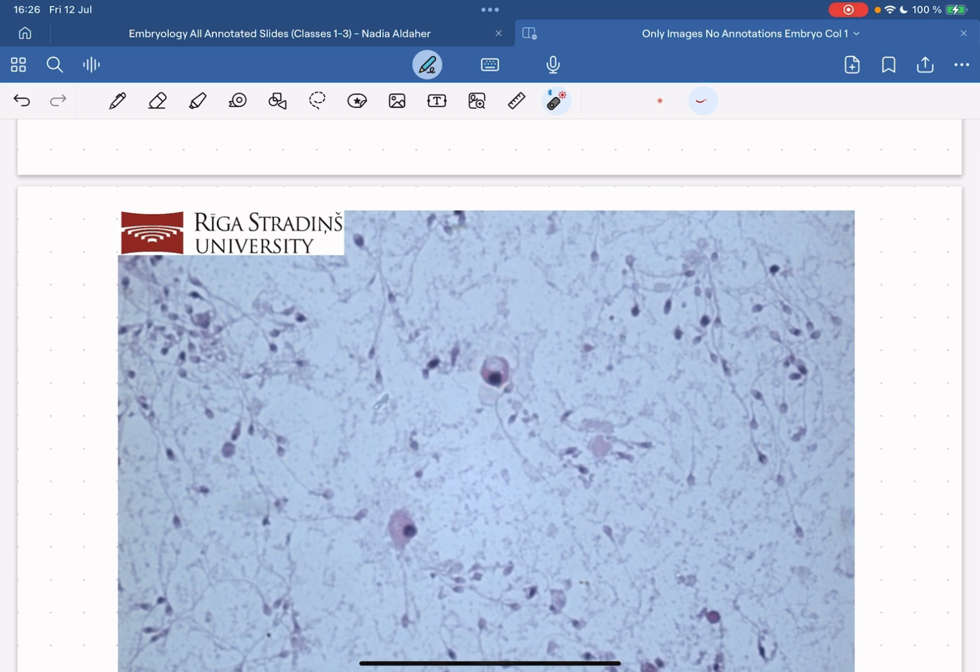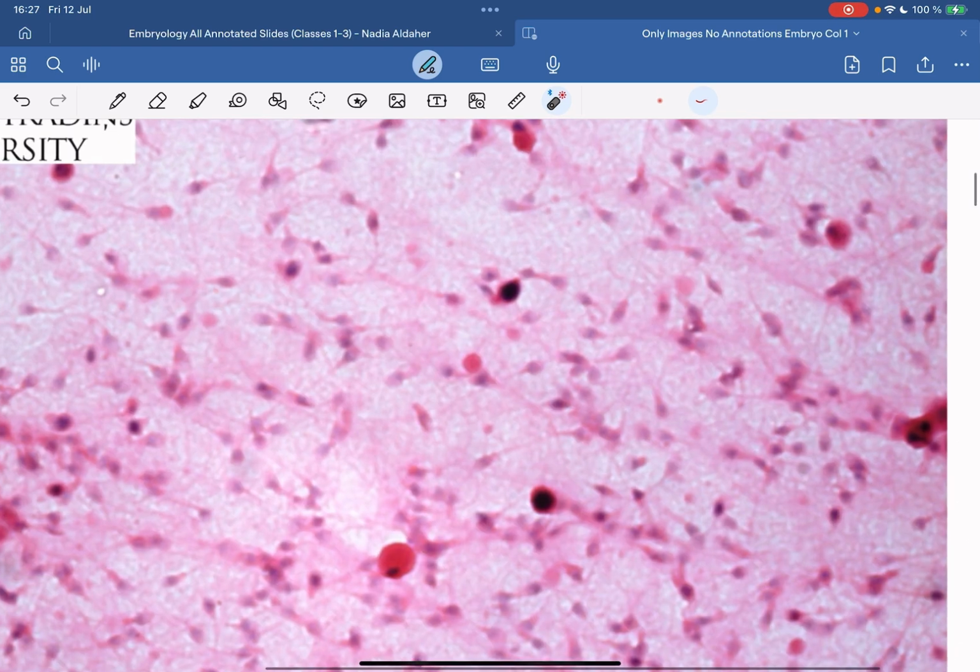This is, in fact, very clear during the practical part of the colloquium. So if you see a cell that looks like this, surrounded by a blob of cells that you can barely distinguish as spermatozoa, then definitely you'll know that you're in human sperm territory, and this would be the urethral epithelial cell.